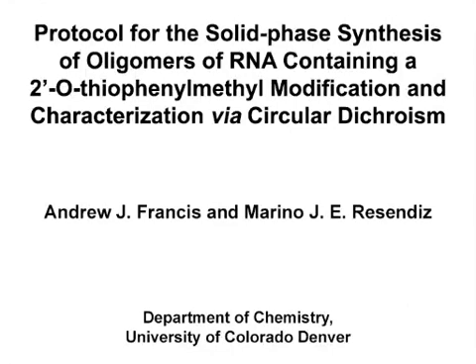The overall goal of this report is to illustrate the procedure to obtain oligonucleotides of RNA via solid phase synthesis. Dodecamers of RNA will be synthesized as models, and their purification and characterization will also be demonstrated.